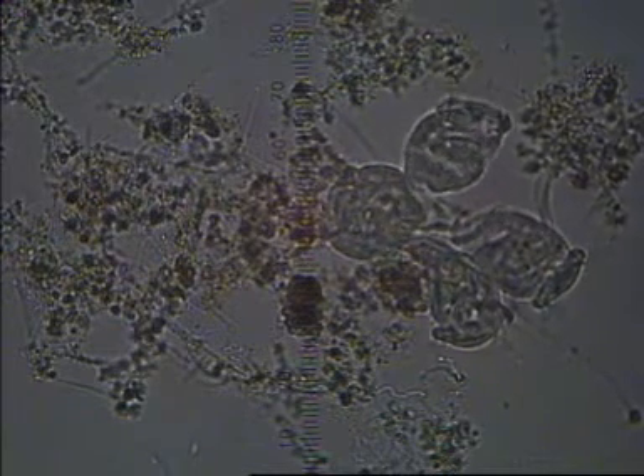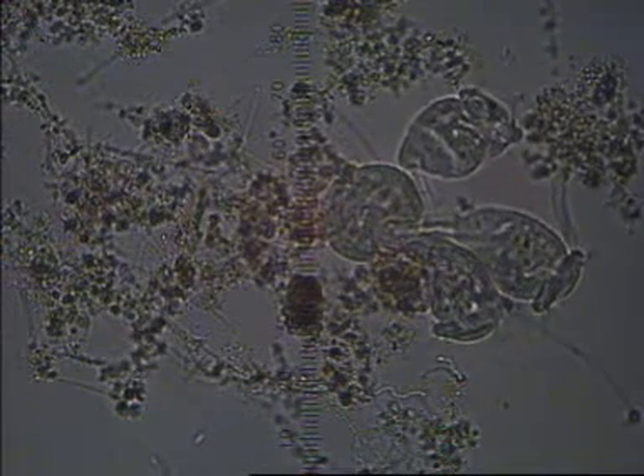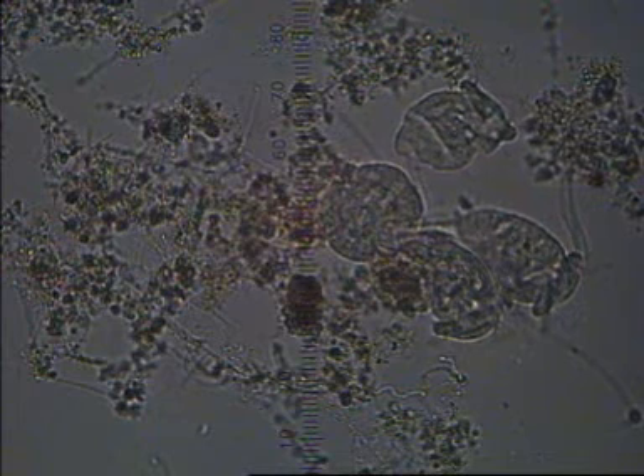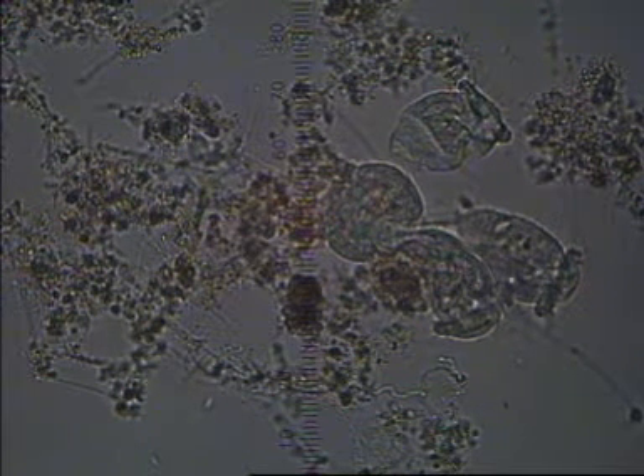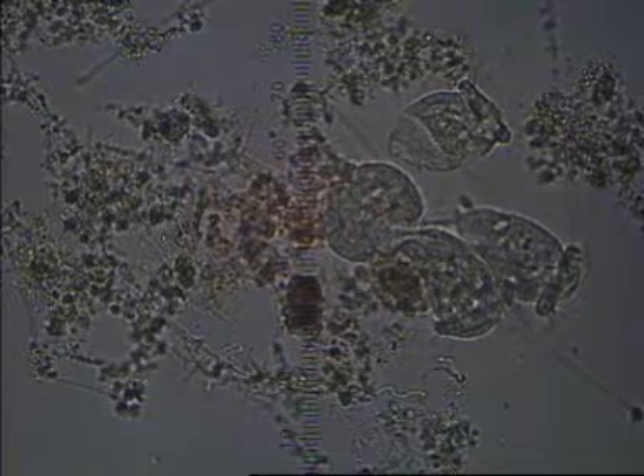That lets us differentiate the Zeuthamnium from Carchesium, the other colonial stalk ciliate protozoa that has a muscle fibre inside its stalk. In the case of Carchesium, the muscle fibres aren't connected, which means it can contract individual heads instead of the whole colony contracting as one like the Zeuthamnium does.